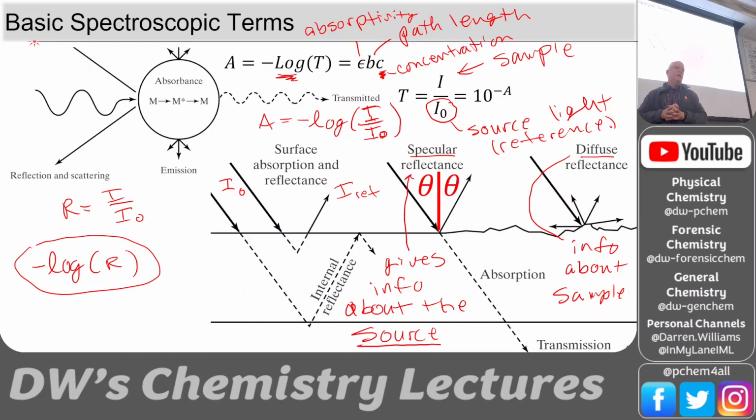So it's the angles other than that special angle. Notice these angles are all at different angles. They're not preserving this angle here. So this is the normal angle of incidence that gives you specular reflectance. All other angles give you the diffuse reflectance. And so if I were wanting to see something about the board, the color of the board, I would not want to look at a bright source that was illuminating it. I would want to look at a different angle.